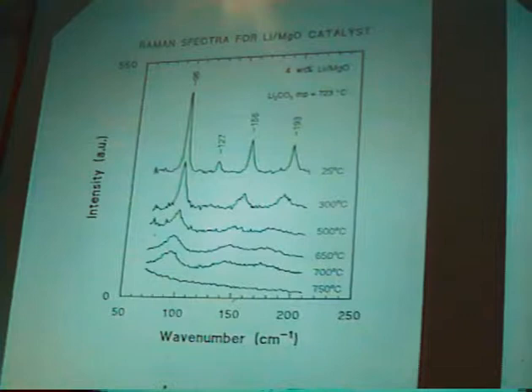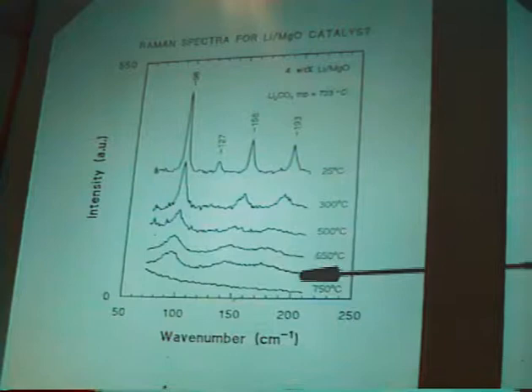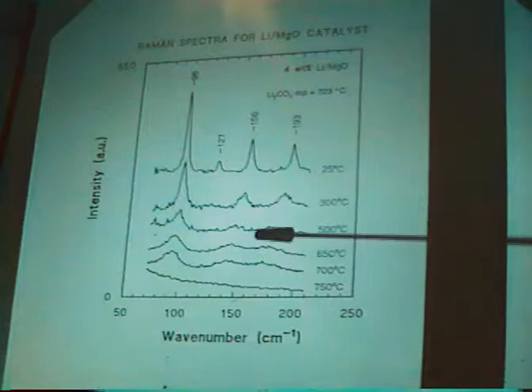And again, I think that Raman spectroscopy is very useful in answering such questions as the state of various supportive materials. Well, I hope that I have introduced you to some aspects of Raman spectroscopy that we have found to be very useful in interpreting some of the behavior of these oxidative coupling catalysts. Sometimes one gets answers that one didn't hope or expect, but nevertheless, I think on the barium peroxide, the evidence supports but does not prove that peroxides are responsible for the activation of methane.